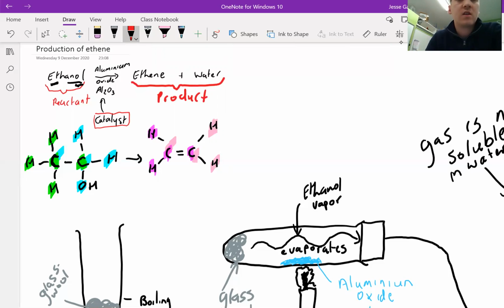So this first product, ethene, that we were looking at down here, where we're drawing the molecule, is missing some of the atoms it had in the beginning. It's missing this. If you think about it, the rest of the molecule is 2 C's with 4 H's, which is what we have in the first product. And if these were to make a molecule, this would be an O and 2 H's.